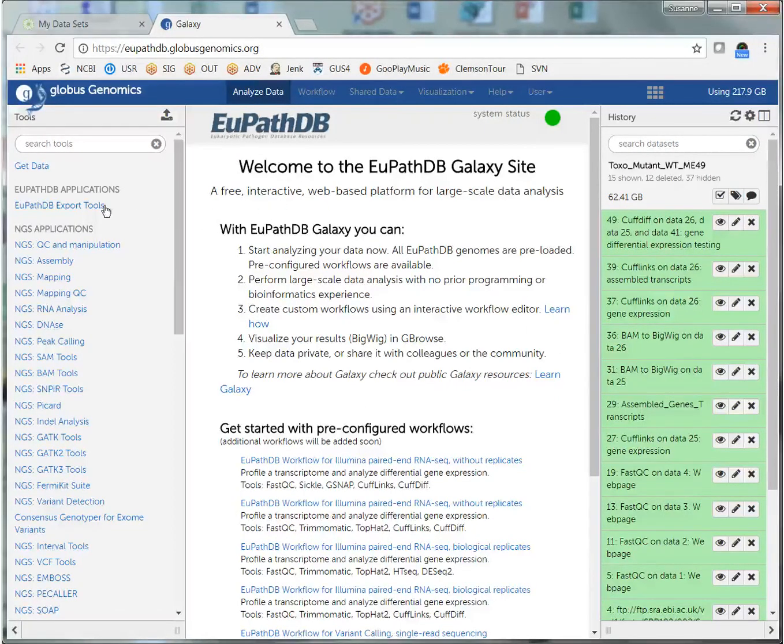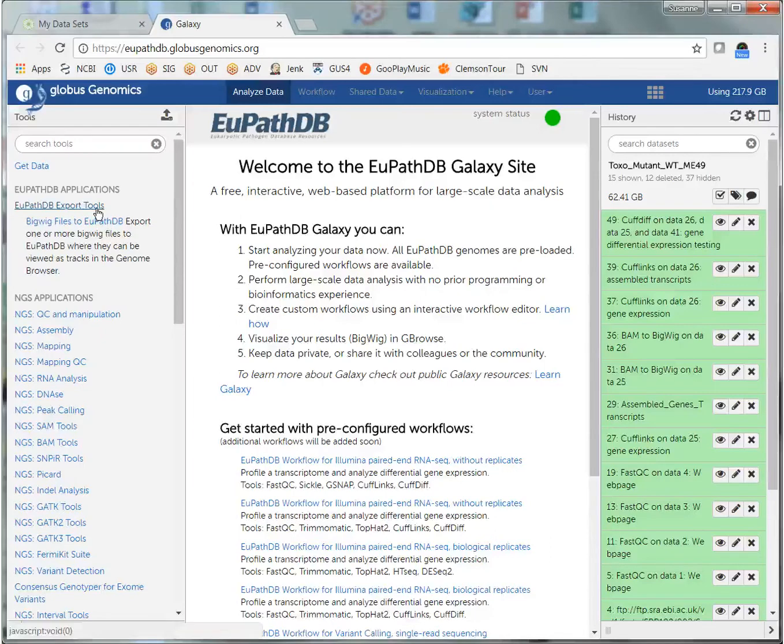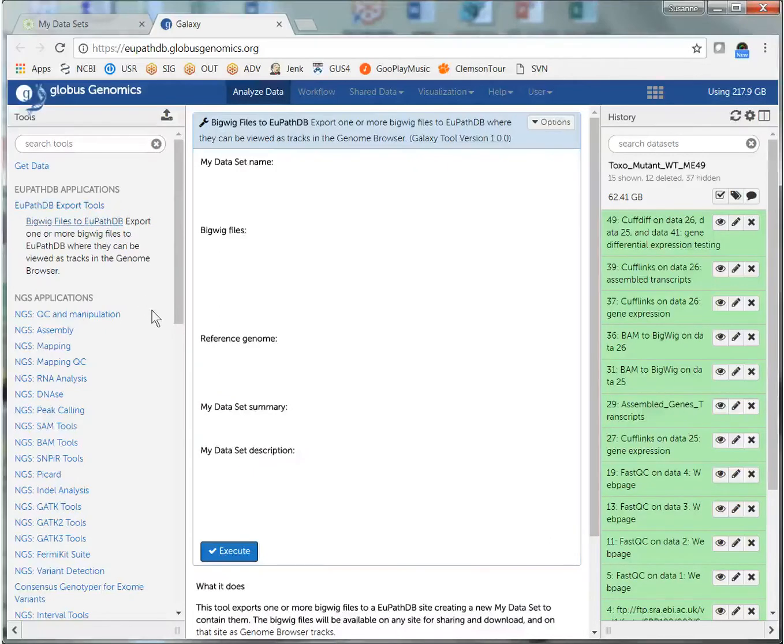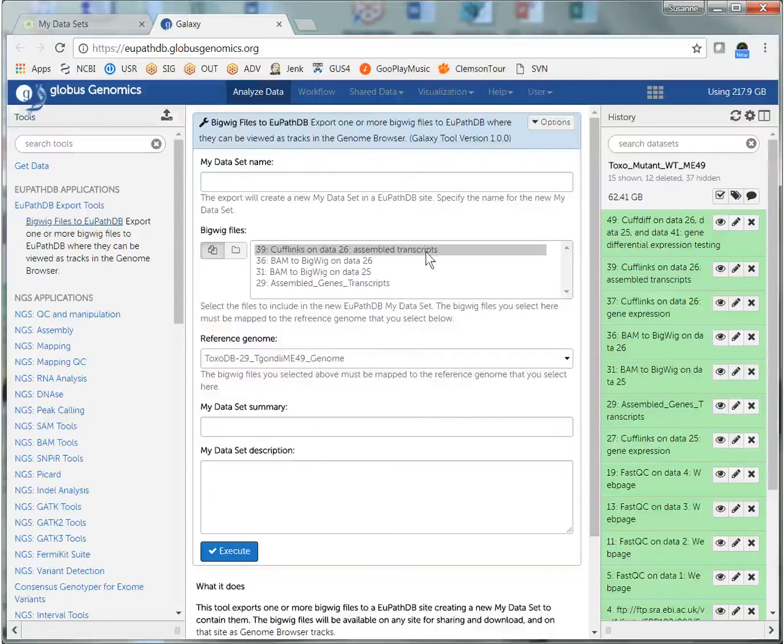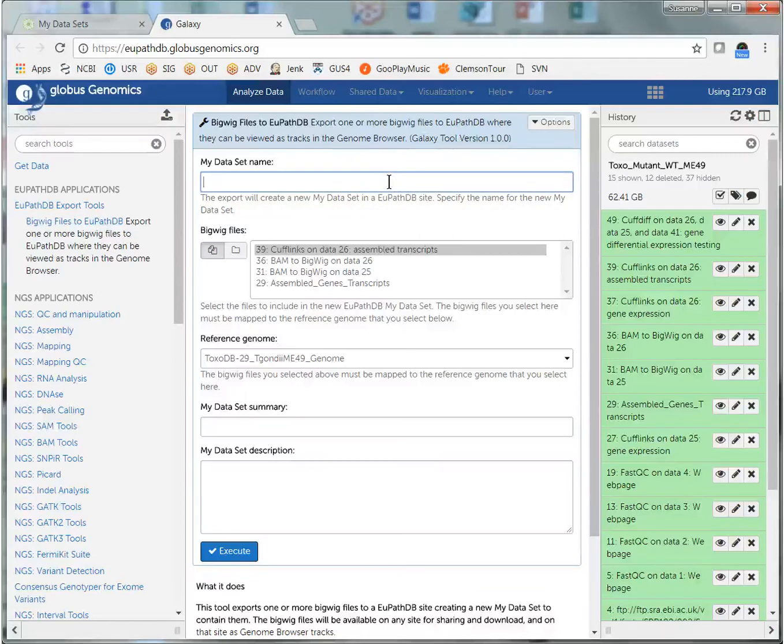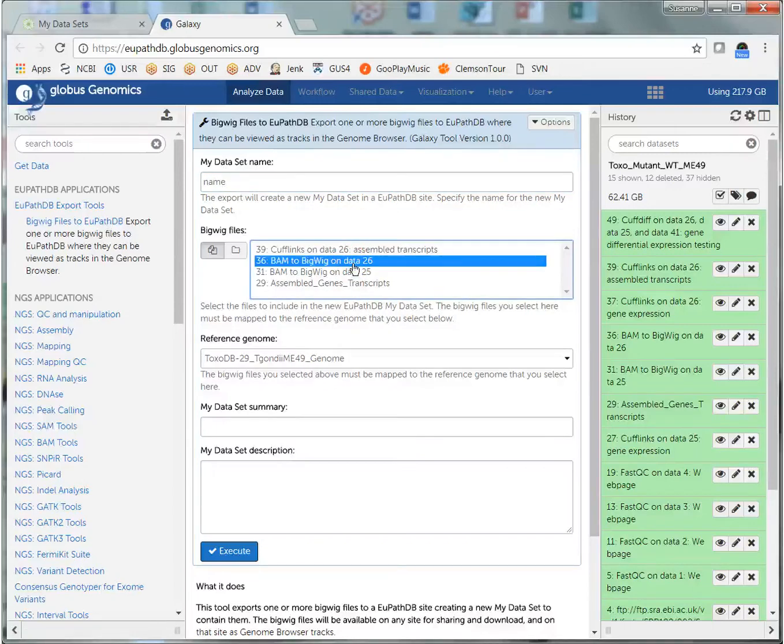To open the tool, I go to EuPathDB Export Tools and click on Bigwig Files to EuPathDB. That opens the tool in the center panel, and I have some fields to fill in. I need to add a name to the dataset, and I need to choose the files that I want to transfer.